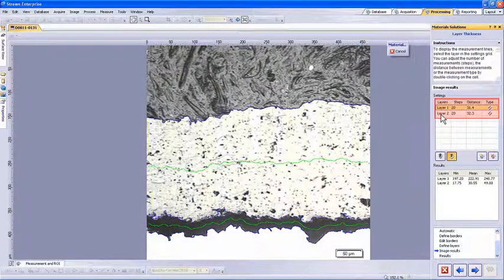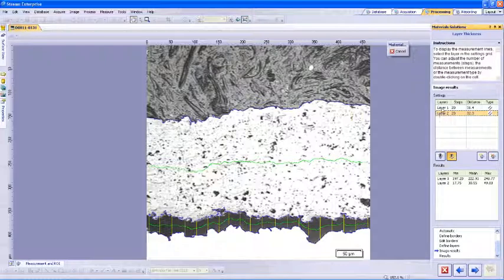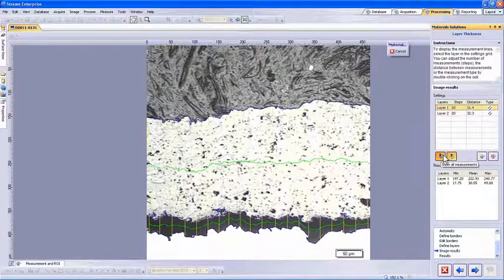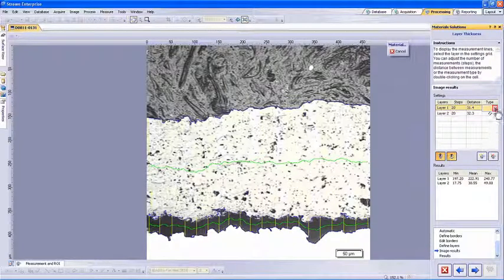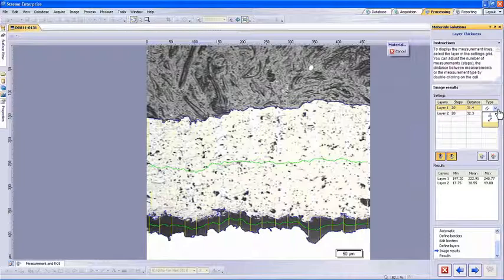We can now see the individual measurement results of the two layers. We can select layer 2 here to display the yellow measurement lines for the second layer. We can also display all measurement lines at once by selecting the Show All button. To select a different measurement type, click on the down arrow button. There are three types of measurements we can use for the layer: Parallel, Perpendicular, and Shortest Distance. The parallel is our default one and aligns the measurements parallel to each other along the layer. Perpendicular will align them perpendicular with the neutral fiber line in green. And Shortest Distance will only show the measurement lines with the shortest distance in the layer.